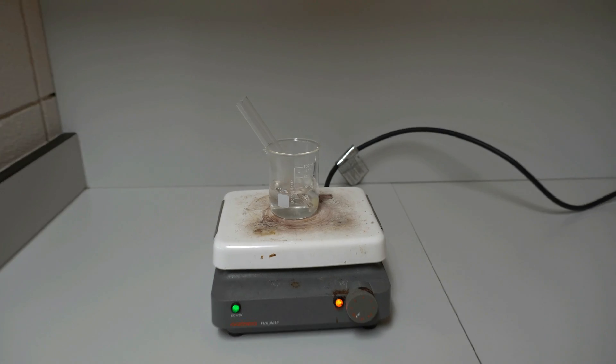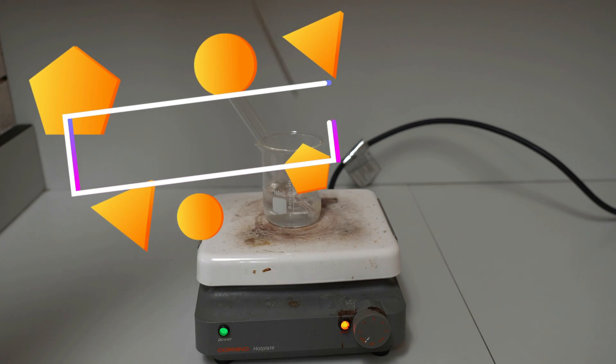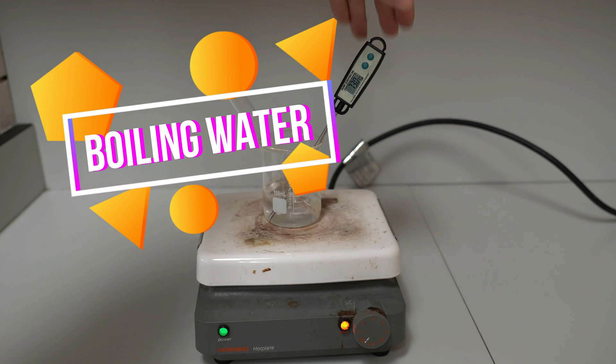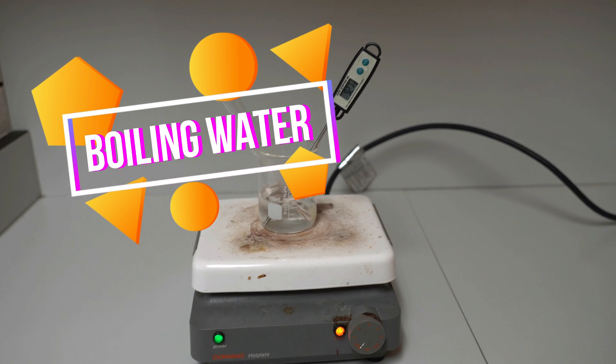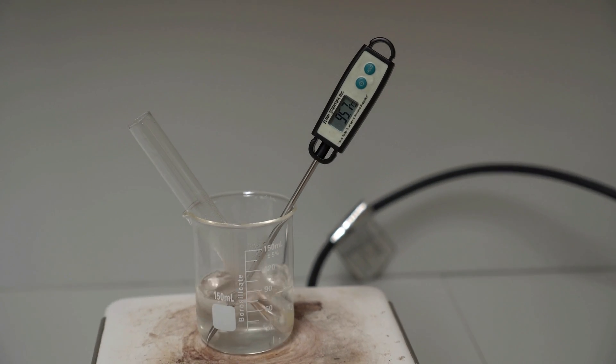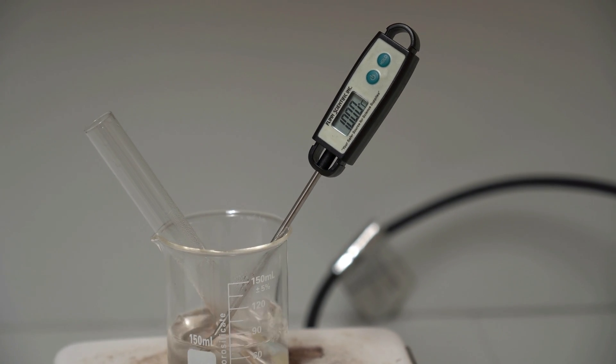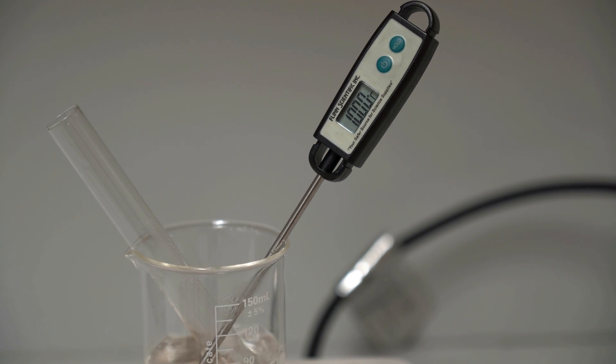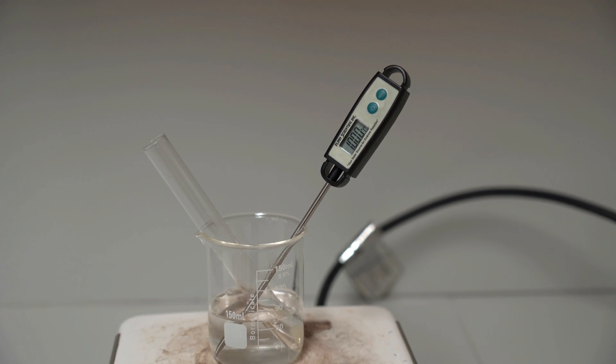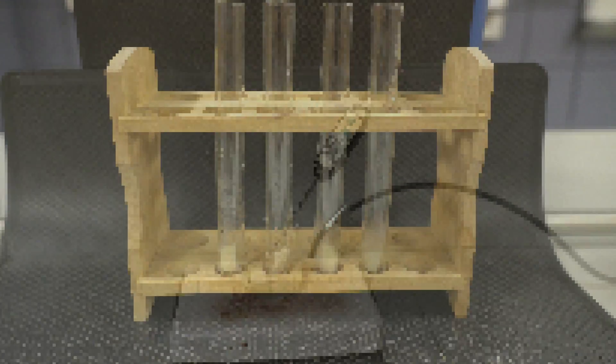Lastly, progressing to the boiling water one. You can see the water is boiling. We've got the thermometer in there. Looking specifically, we're going to balance out right at 100 degrees Celsius for our boiling water potato. We'll let that sit.